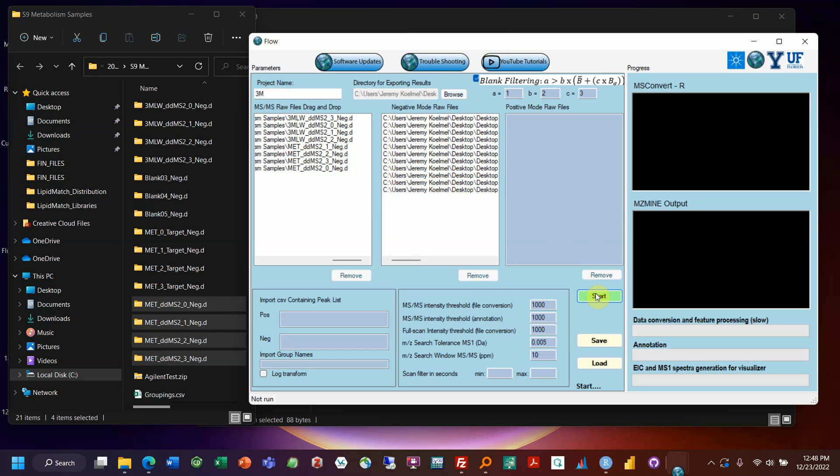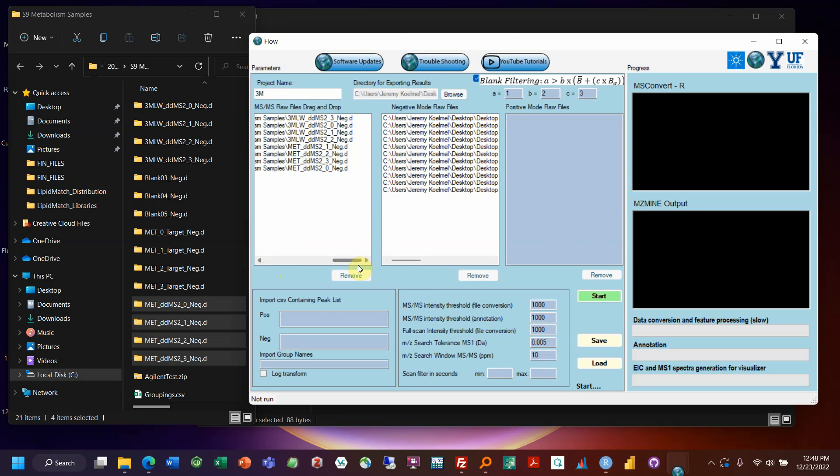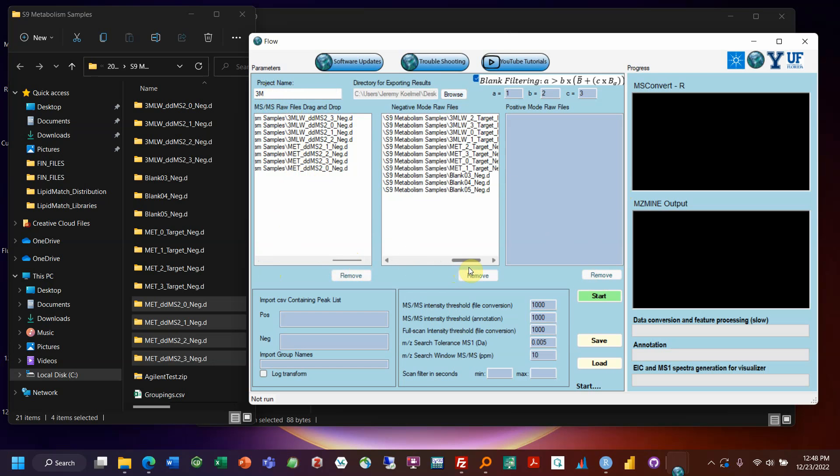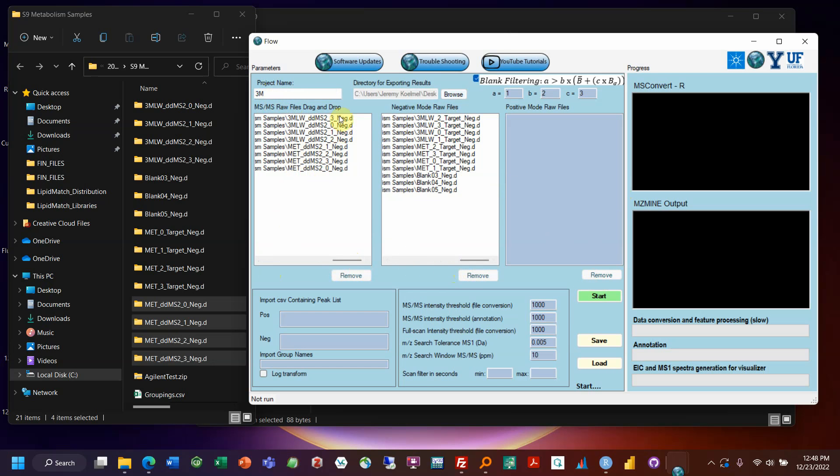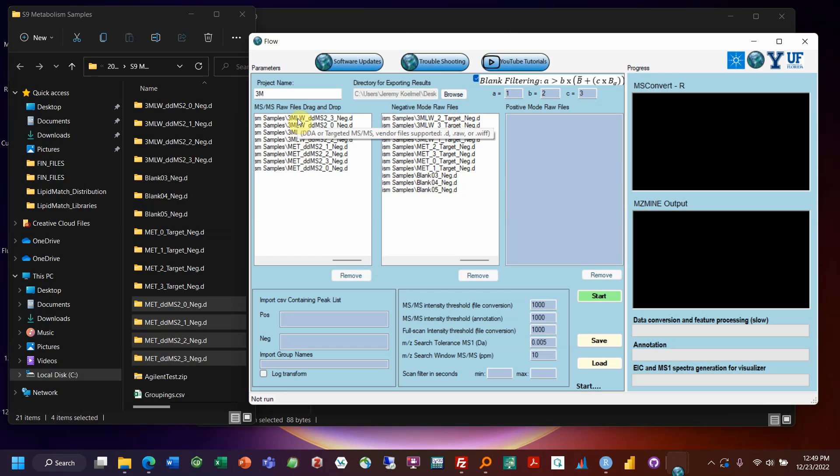So you could click start now and it would run. There are some new options in this new version of FloroMatch that I think are very important to consider. So there's statistics that will be integrated into the visualizer. It is integrated if you run it. So you can see here that I named my files underscore DDMS2 underscore for data dependent. I put underscore neg at the end of everything. You want to do that. And blank and blank file names and target in the reference sample names. So that's the kind of naming conventions you want to use.